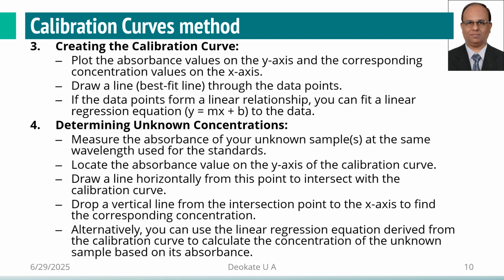Whenever you are using y equals mx plus c, the unit of concentration will be the unit of your standard. Whatever series of standards we are using, if the standards are in ppm, that is microgram per ml, your sample concentration will also be in ppm or microgram per ml.